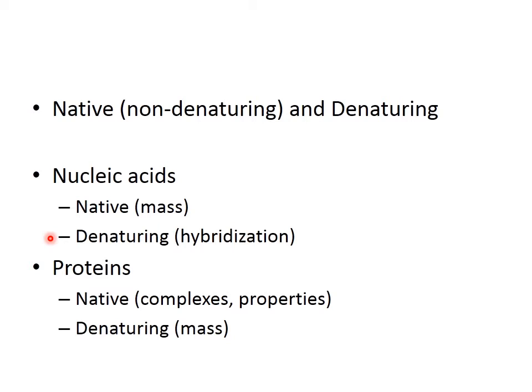Denaturing electrophoresis is also used for some applications. For example, when DNA hybridization has to be carried out, DNA must first be denatured and converted into single-stranded form.